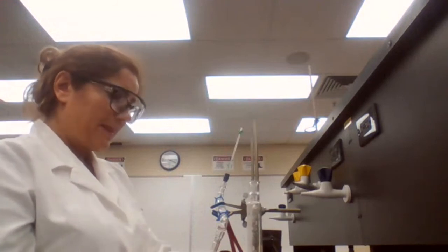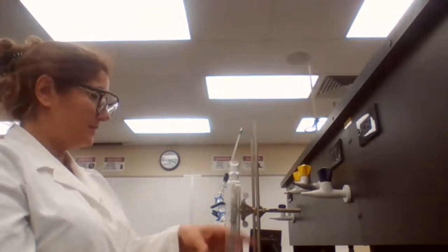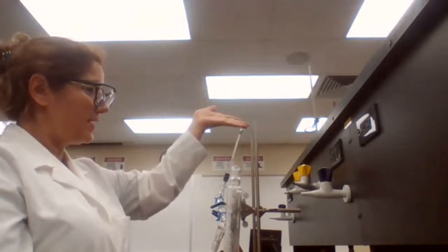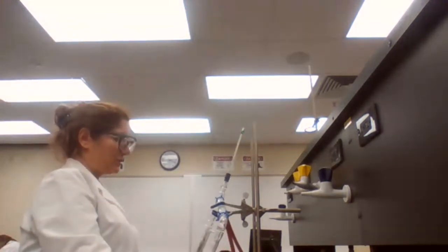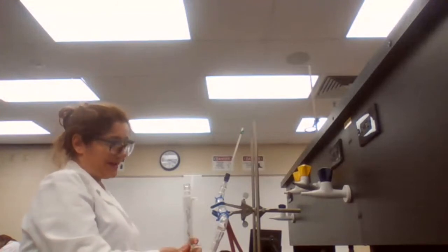first. In terms of the equipment, the only difference is that you're adding a fractionating column. It's going to increase the height of your setup. So we have to shift everything to a much higher level so we can fit this underneath the distillation head and have a better setup.